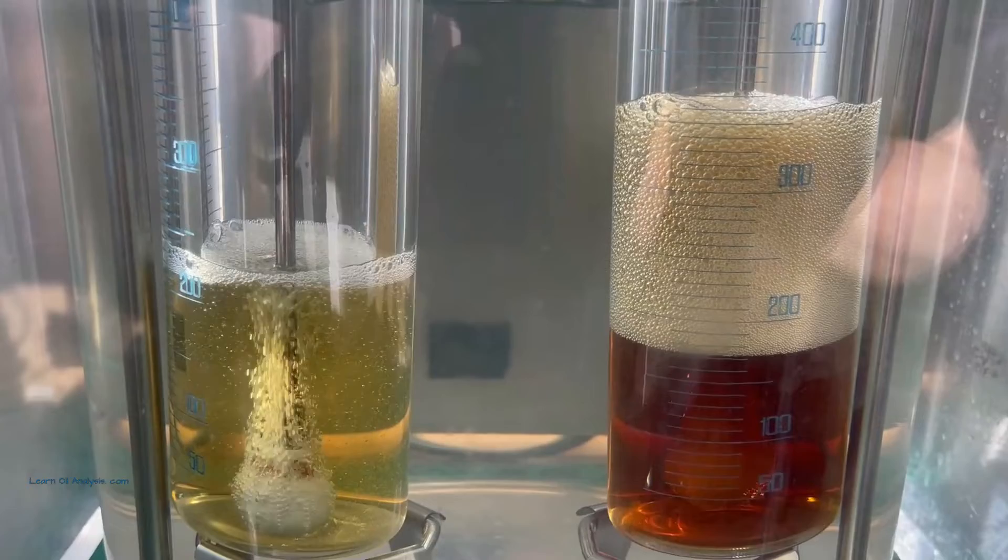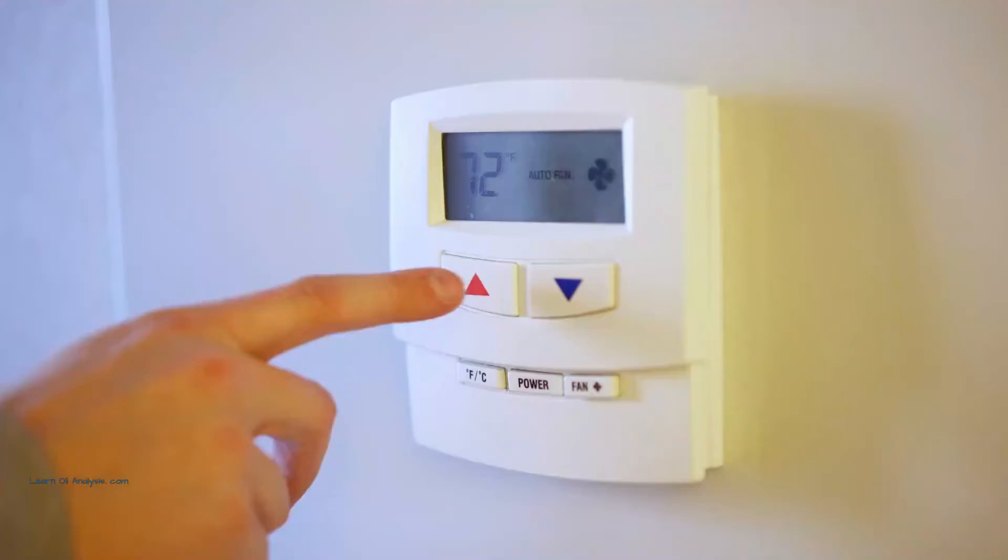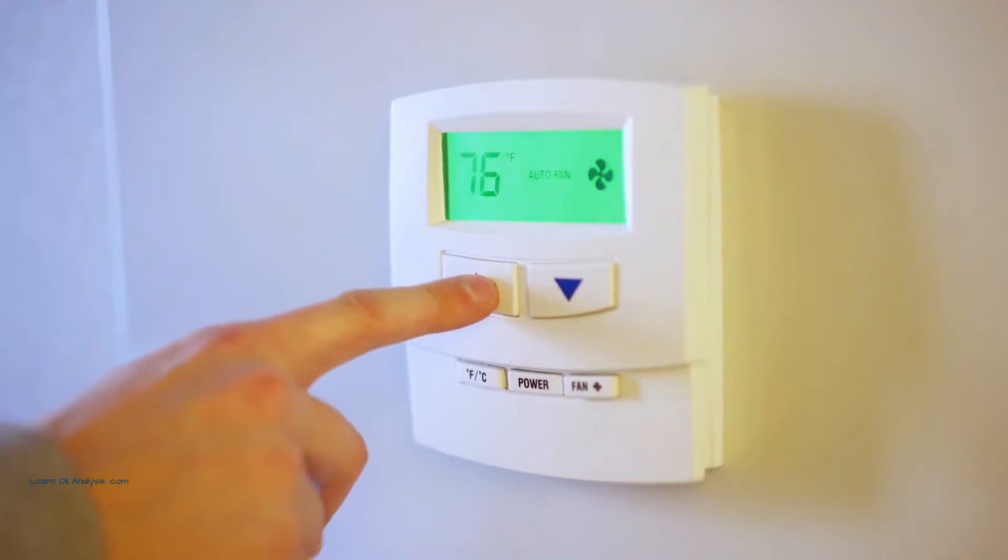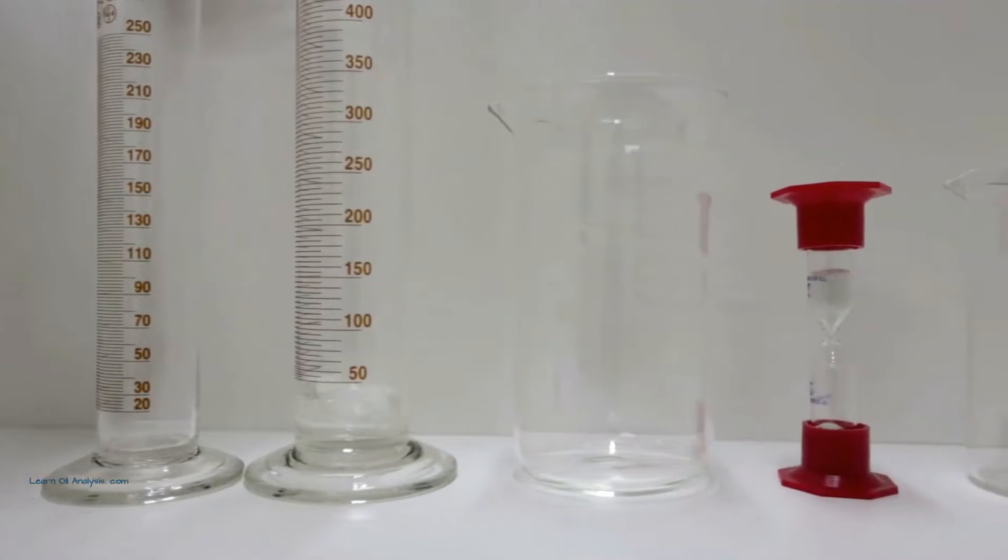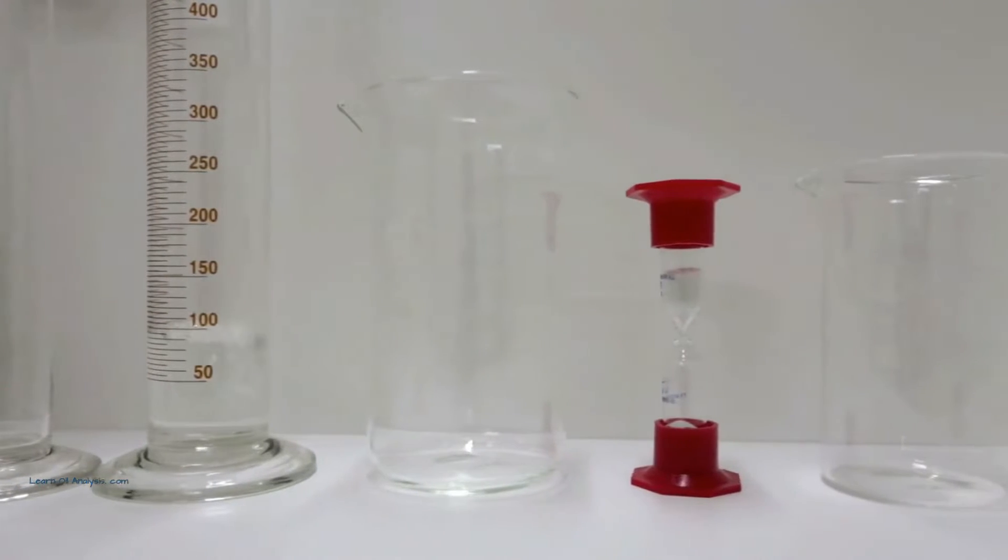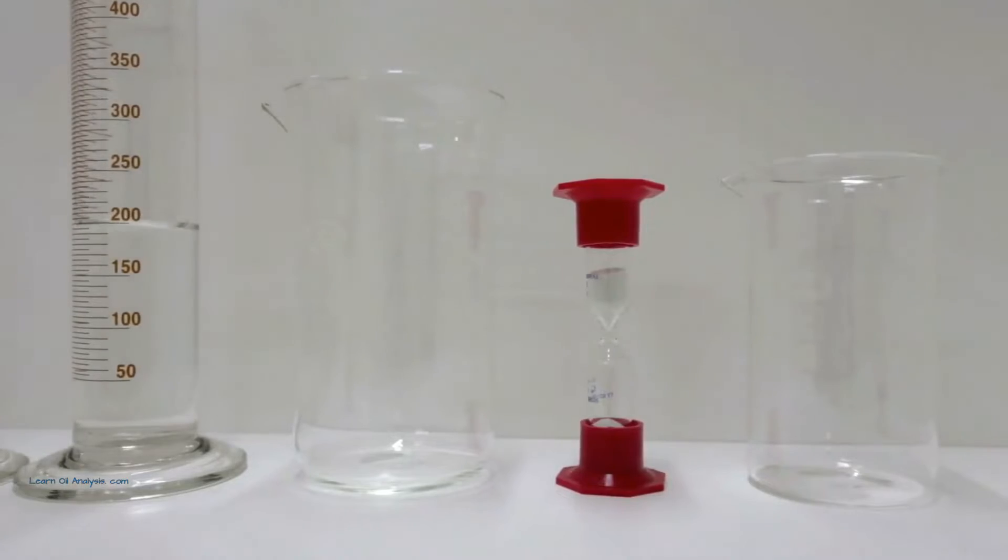The ASTM standards outline 4 main sequences for this test. Sequence 1 is room temperature testing, which serves as our baseline. Sequence 2 involves high temperature testing at around 93 Celsius or approximately 200 Fahrenheit, and this is where things really heat up.